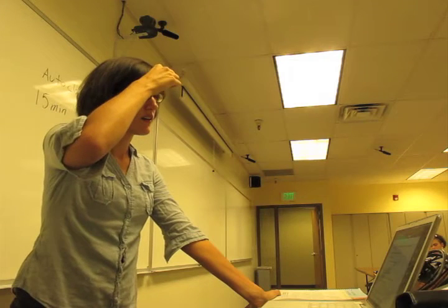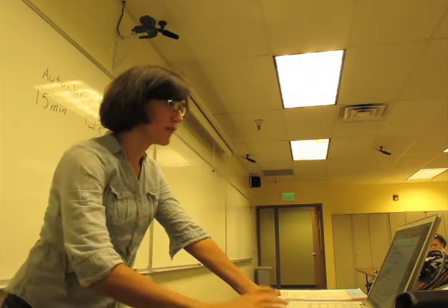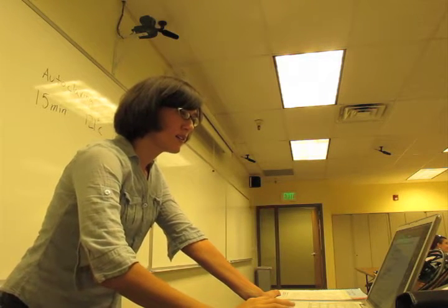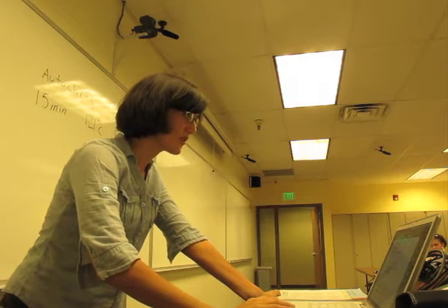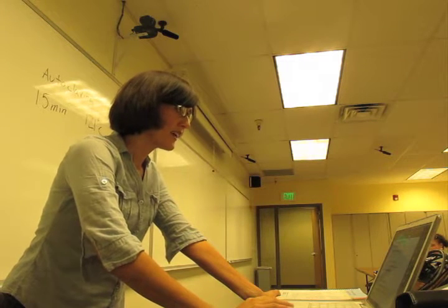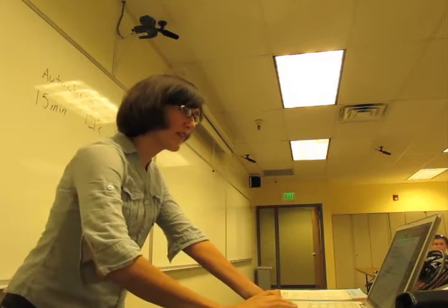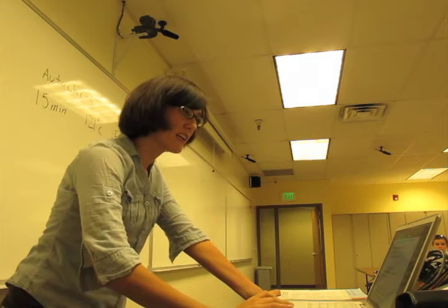Which I think you guys did, not in last lab, but the one before that. So, I just kind of answered the next question. You inoculate an agar slant with an inoculating loop, and you just kind of swipe it back and forth across the top. And then in an agar deep, you just stick the inoculating needle down into it.